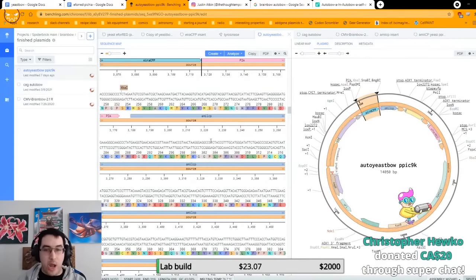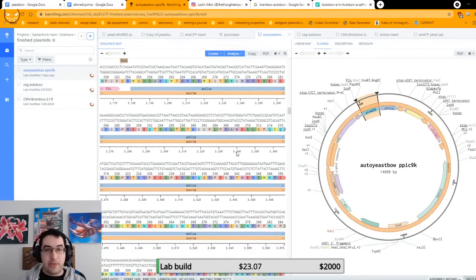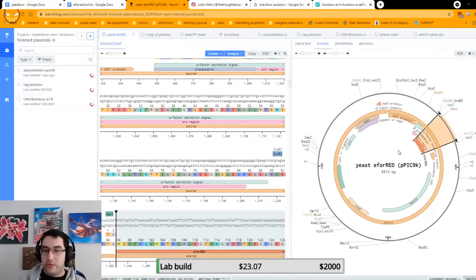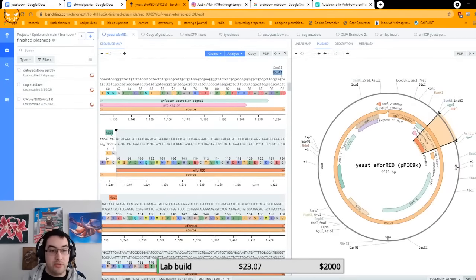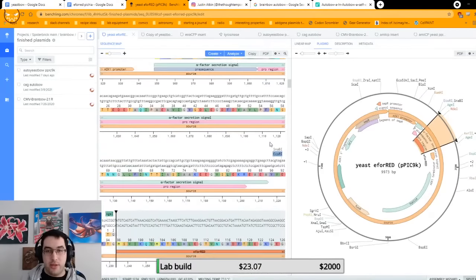Yeah, basically, I put restriction sites on the ends of every single one of these proteins. The reason that I did that was so that I could make this, which is essentially just cutting out the fluorescent protein and sticking it into the same backbone plasmid, but that's empty. So it doesn't have any of the rainbow stuff, but it does have the plasmid with convenient restriction sites on both ends. So there's a convenient restriction site, there's a convenient restriction site, and these restriction enzymes are dirt cheap.